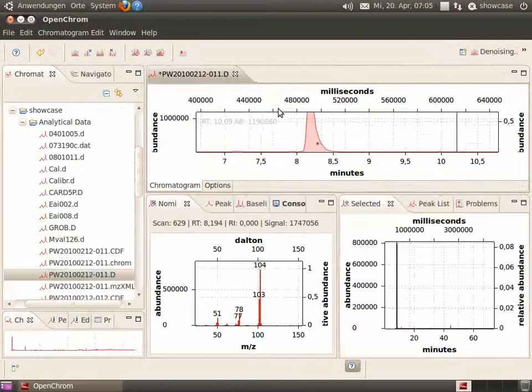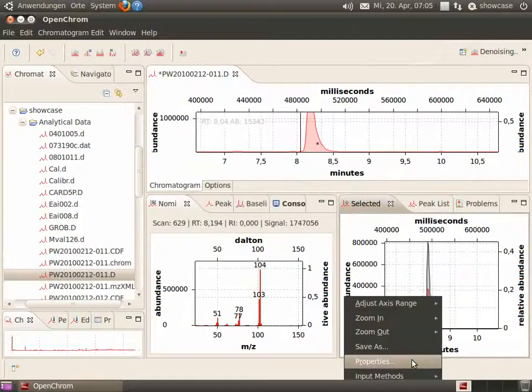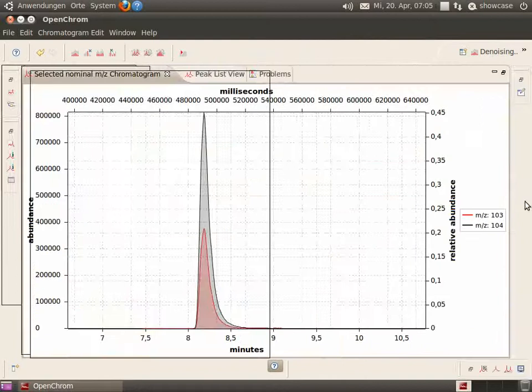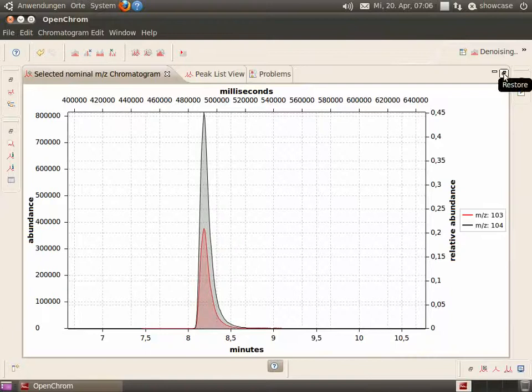Let's go back to the default perspective as we had it before. And let's have a look at the mass fragments in our mass fragment trace. They are still available.